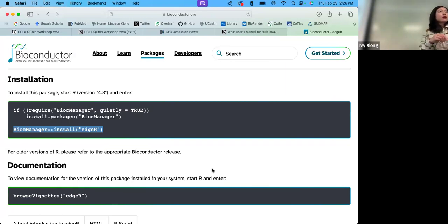I guess most of us have experience working with RStudio, right? I was entirely new to it. So trying to get packages and then run script. What does it mean? What's the dimension of the? The two-dimensional.